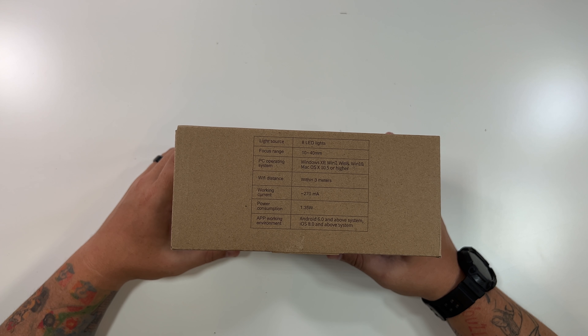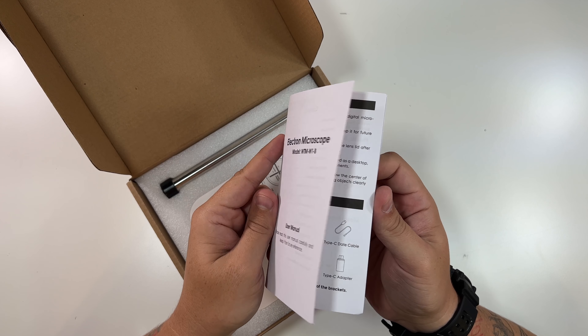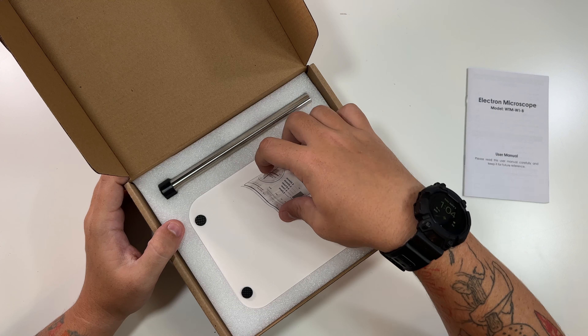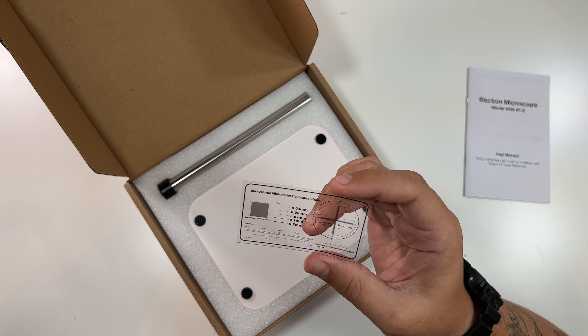Wi-Fi distance is within three meters, focus range is 10 to 40 millimeters, light source is eight LED lights. PC operating systems supported are Windows XP, 7, 8, and 10, plus Mac OS X 10.5 and higher. The app works with Android 6 and above, and iOS 8 and above.